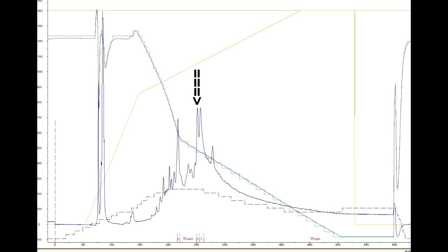Then we realized that the second peak actually had another component. So we had to hit execute again with 10 still in it in order for the fraction collector to quickly switch from 2 to 3, the third test tube.